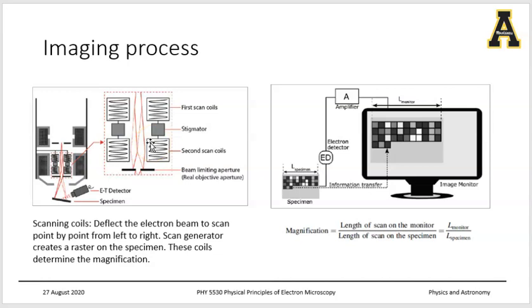They use digital to analog converters to get the appropriate deflection, and essentially you move each time. As you can see here, you have these different squares that represent the rastering motion of the electron beam to generate the image.